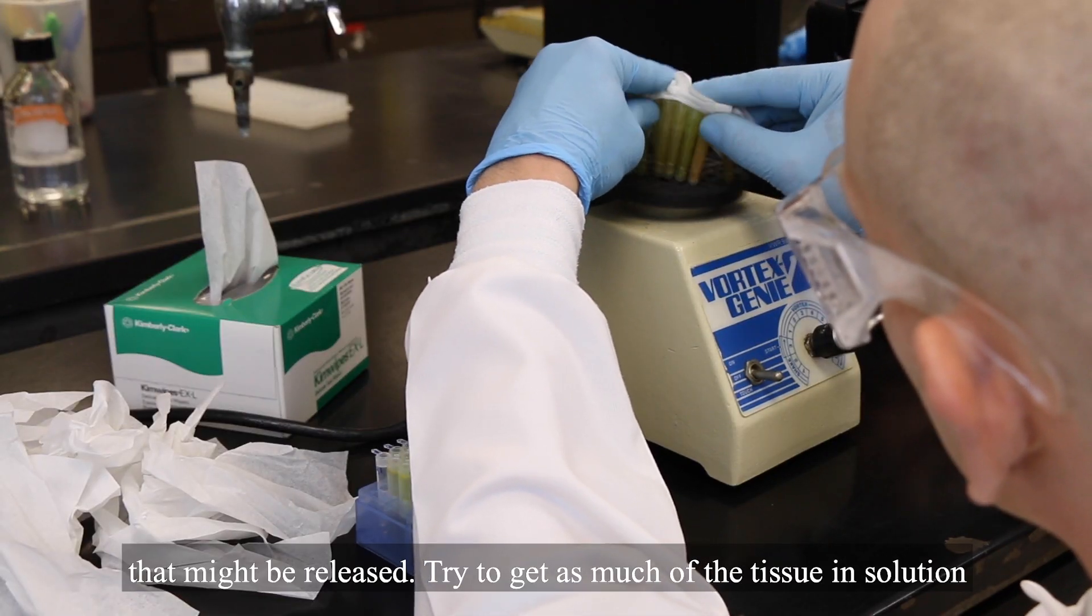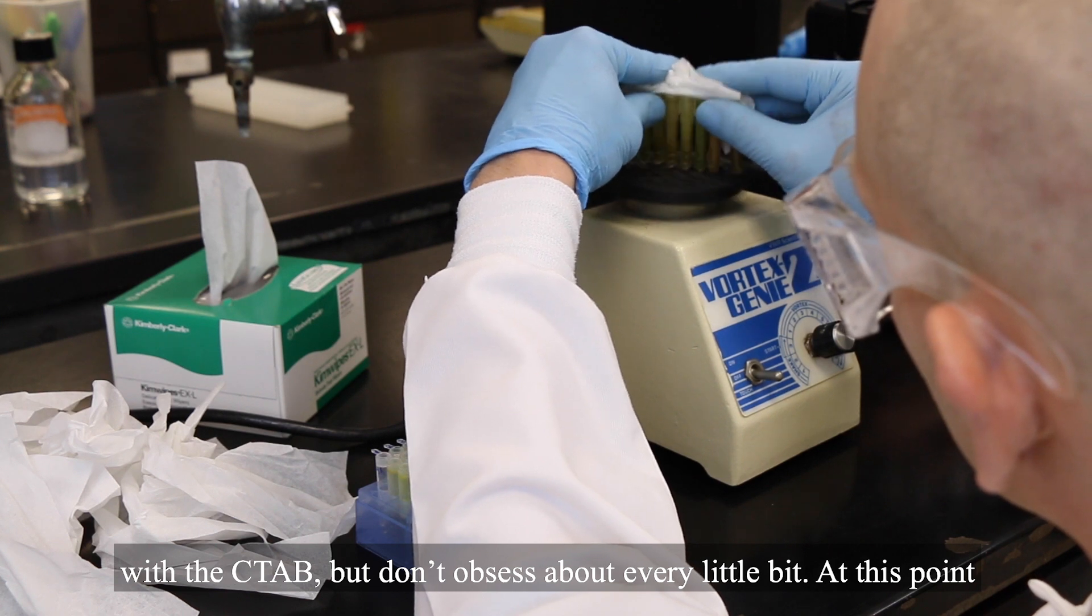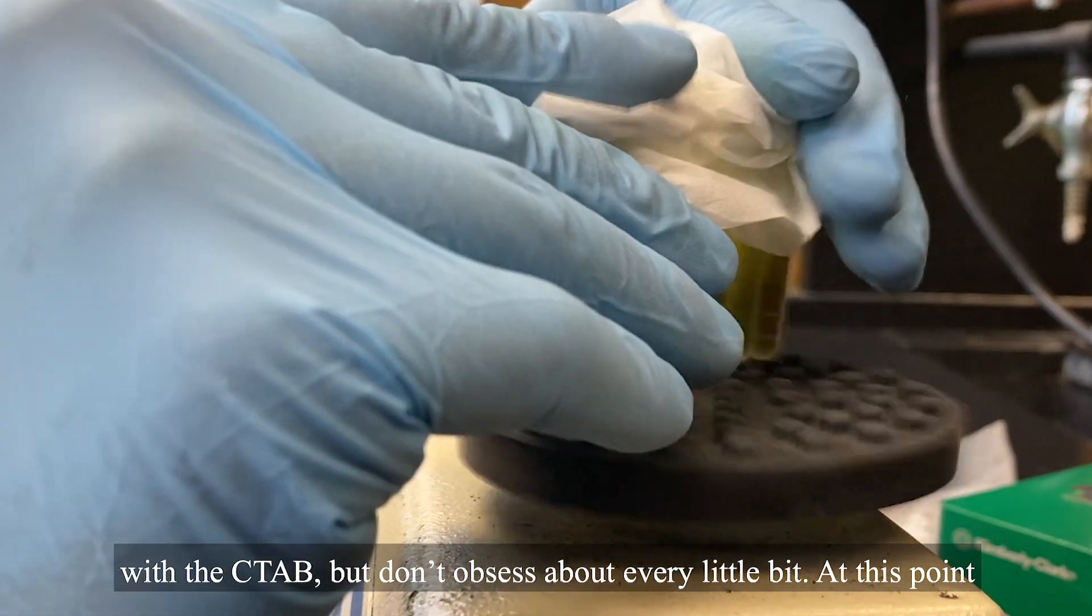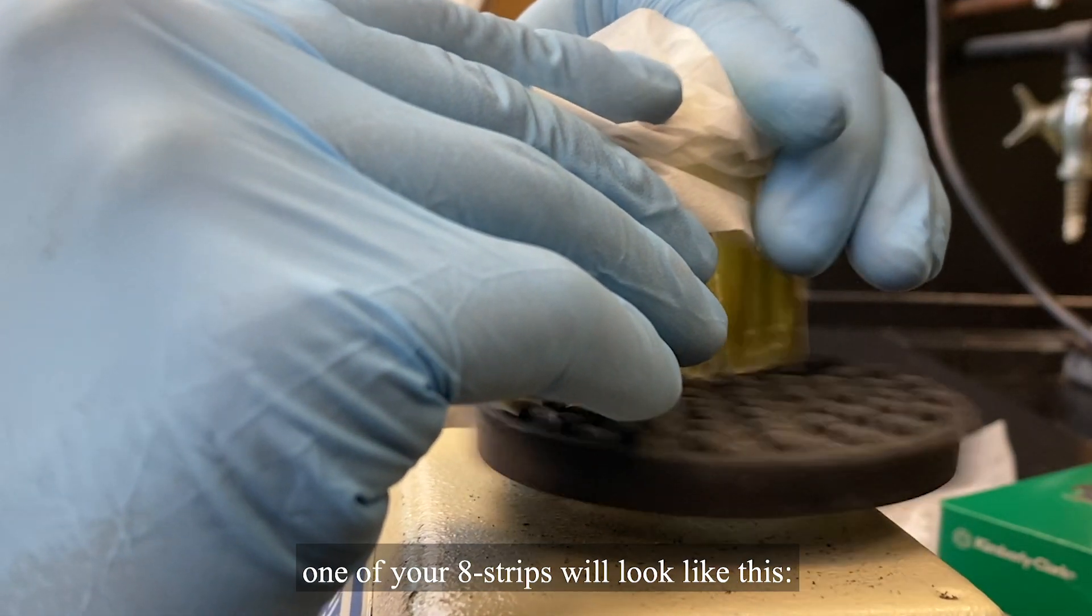Try to get as much of the tissue in solution with the CTAB, but don't obsess about every little bit. At this point, one of your 8-strips will look like this.